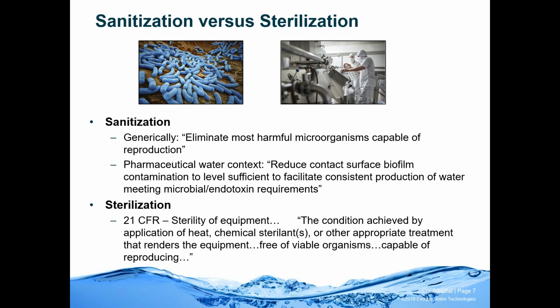If you think of it then in pharmaceutical water, any contact surface that the water is going to contact may require sanitization, and those surfaces need to be protected, not necessarily completely from any biofilm formation, but ideally minimizing it, limiting it, so that the micro contamination level of the water is consistently good enough for production of the products that you're going to make.